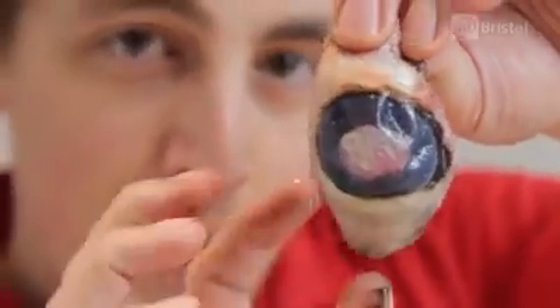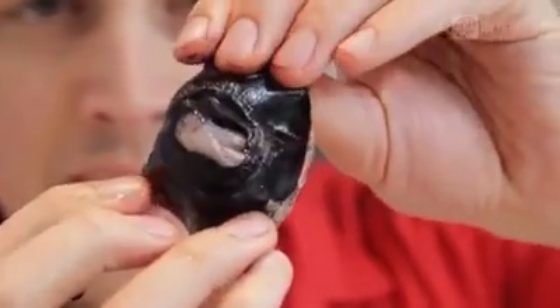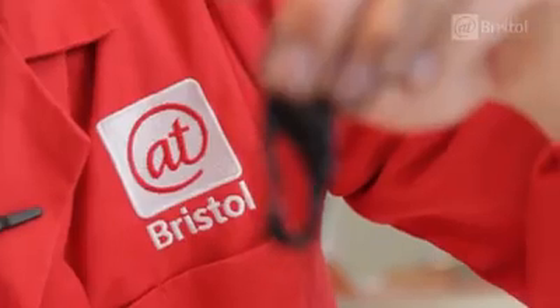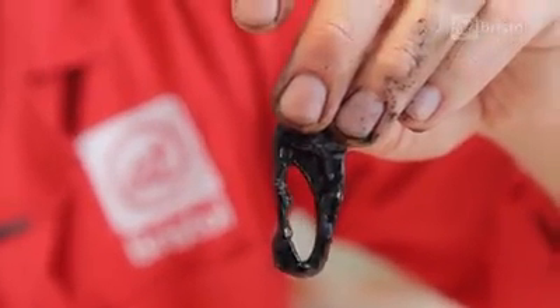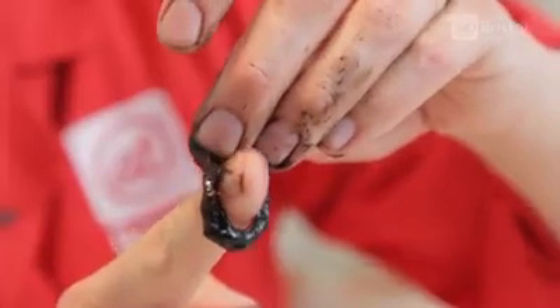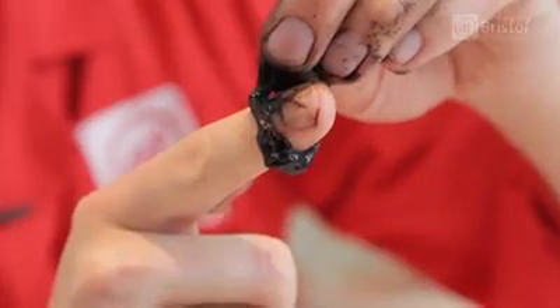Here we have the front of the eye, and once again you can see the cornea just here. But if we turn this around, on the inside we can now see the colored part of the eye called the iris. The iris is a muscle which controls how much light enters the eye. So if you're around lots of light, then it will close down, making the hole here — called the pupil — very small.